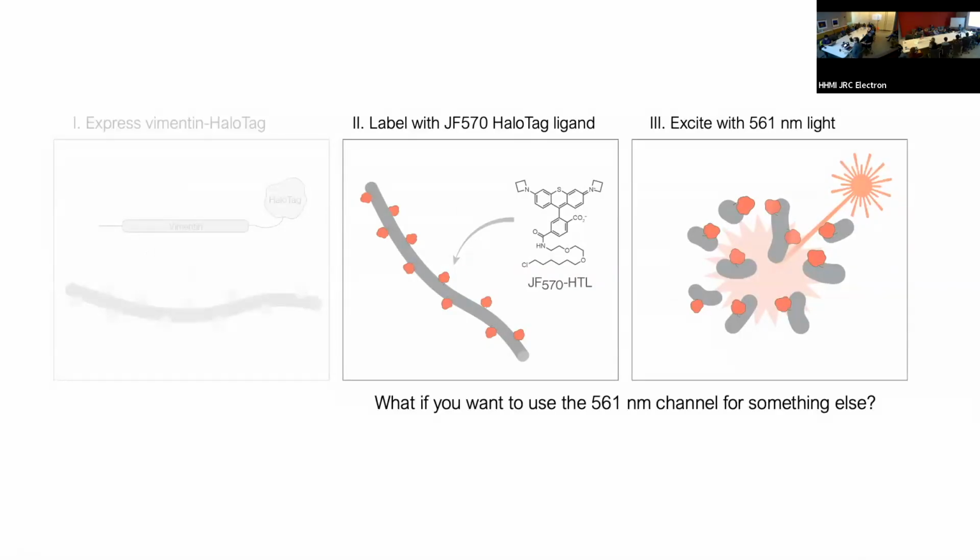Now, we showed JF570 halo tag ligand, which is sort of the flagship photosensitizer dye that Luke's lab designed. But you can imagine a number of circumstances in which you wouldn't want to use the red channel for this. You might want to co-express, say, Tom20 mCherry to see the effect of vimentin loss on mitochondria. So we wondered, is it possible to find a spectrally separable photosensitizer, ideally red shifted, so we can use even longer wavelength light, which would be less damaging, could penetrate farther into tissue.